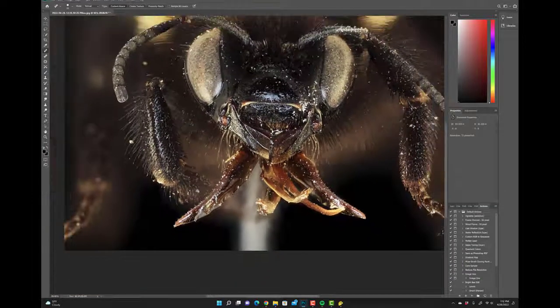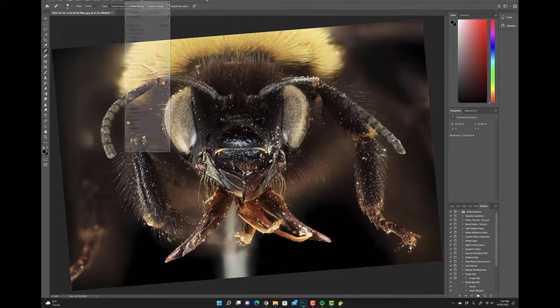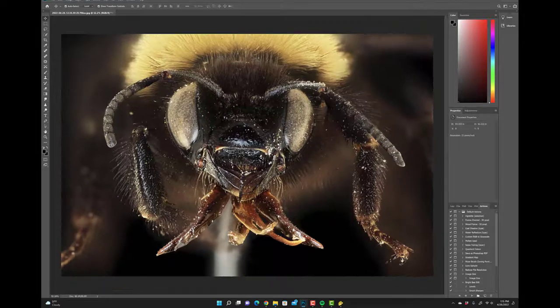But obviously the best place to really start is a clean specimen. If you can get your specimens clean without having to do this, it's going to save you a lot of time, and you don't have to worry about it so much. Okay, the other thing that can sometimes happen is because it's touchscreen, you can rotate the specimen, as I just did here. The fastest way is to just hit Escape on your keyboard. That'll reset. Or you can go over here to the hand tool and rotate view tool, which is also R, and that'll reset your viewpoint as well.